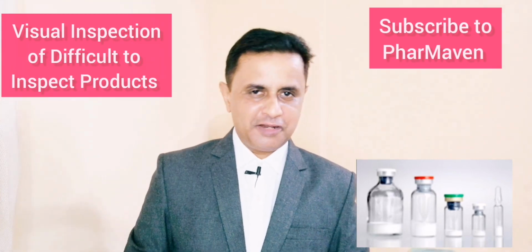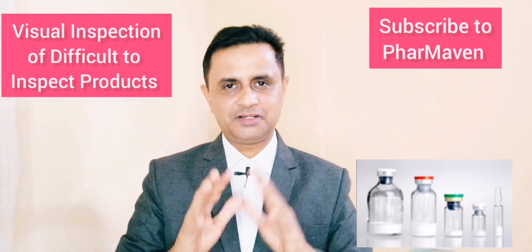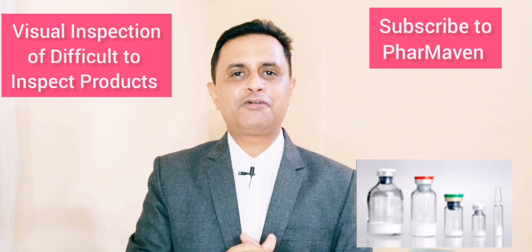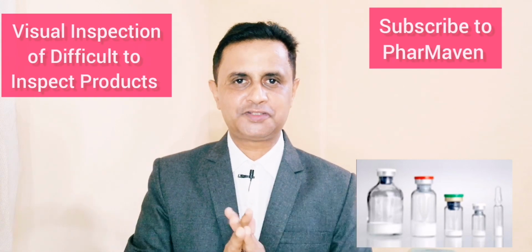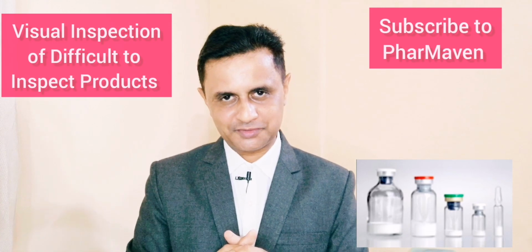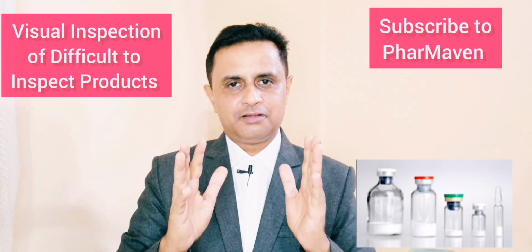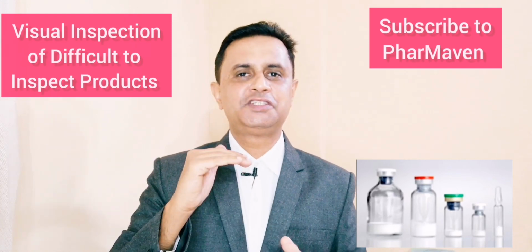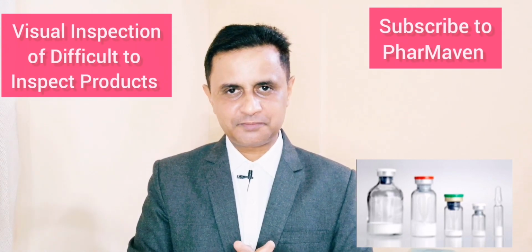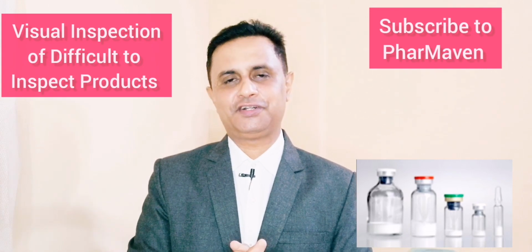Starting with the lyophilized product, as we know, lyophilized products are cakes. It's a cake inside the vial, so we cannot see what's inside the cake. We can only inspect the external surface, upper surface, the surrounding body, and at least the bottom of the visible cake appearance. So in our procedure, we should include cosmetic defects, whatever is visible, the external surfaces, and if there are any defects there, it can be rejected.